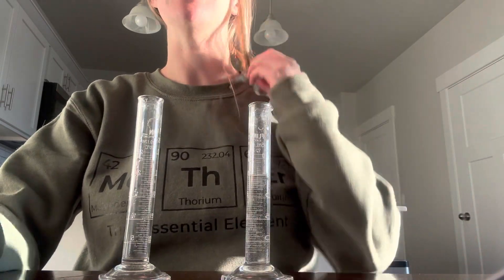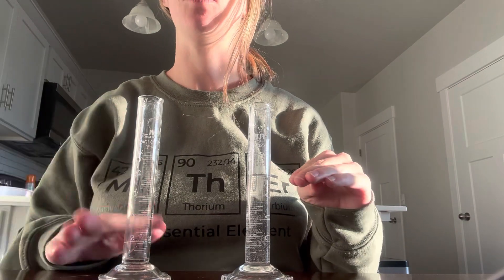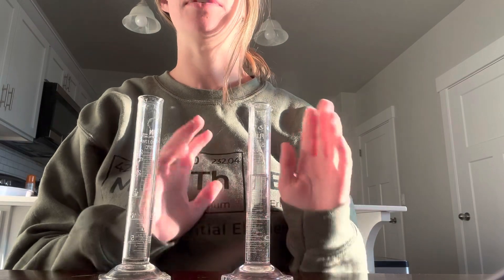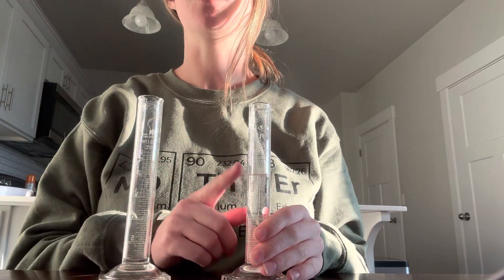So first thing for part one is to fill one of your graduated cylinders up to 20 milliliters, and then one is empty. Remember to do it from the bottom of the water line. Fill it up to the 20 — there's a big 20 on it.